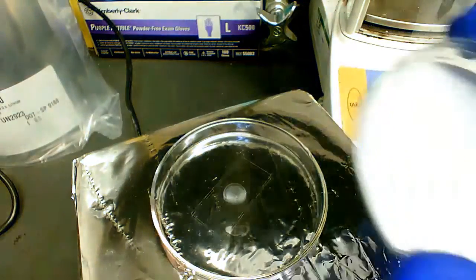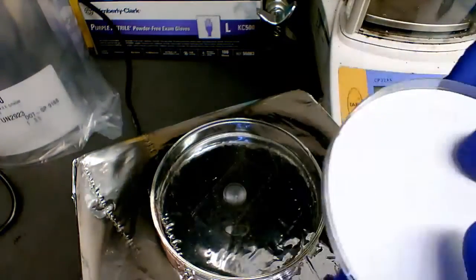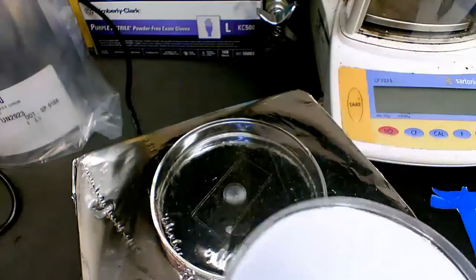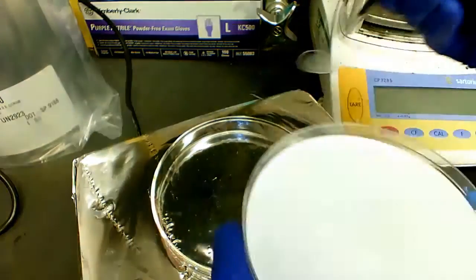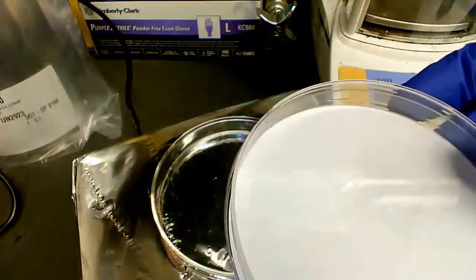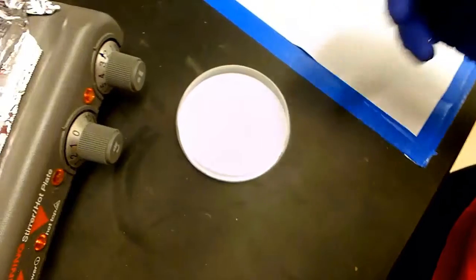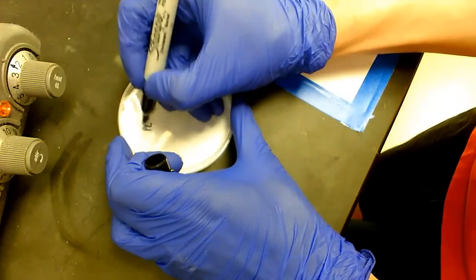So you're gonna grab one of those plastic petri dishes. You can also insert a piece of weigh paper into the petri dish like that, and now you're gonna grab the polymer sample and put it in this petri dish, and make sure you are giving the name. Make sure you're saying what it is. So we know this is PO, for example, right?